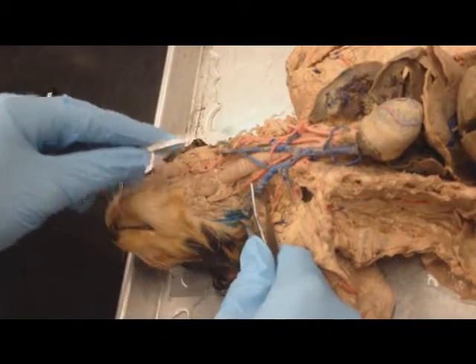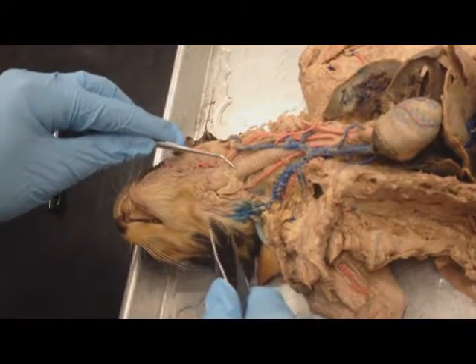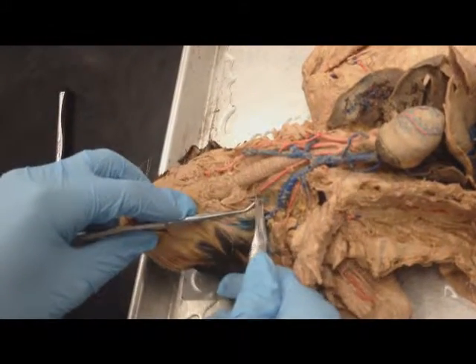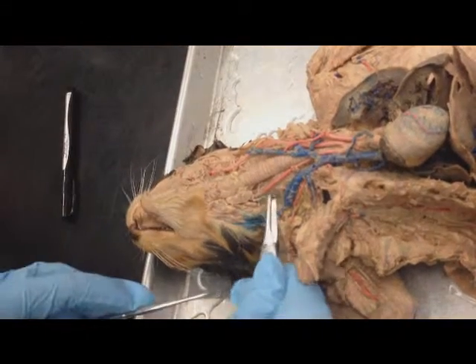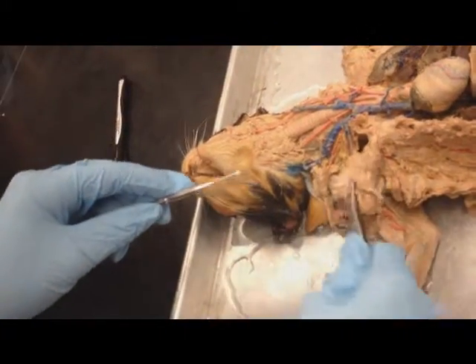Sometimes this would be external jugular. There's 2 of them. And sometimes you'll find one that crosses and connects the 2. That's going to be called transverse jugular. And here, sometimes you can't find this on a cat, but that's going to be internal jugular vein. This is just the smaller one, and it's more medial.